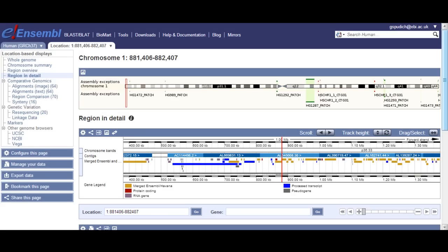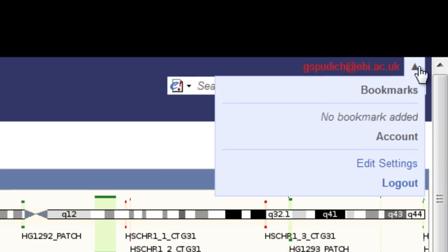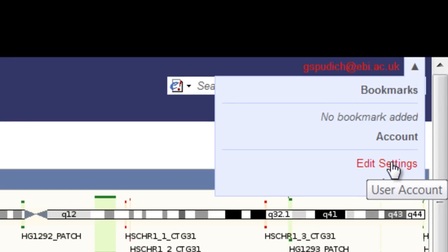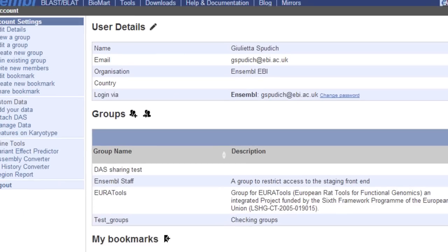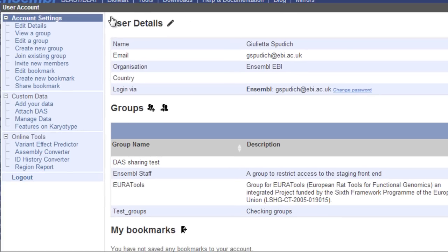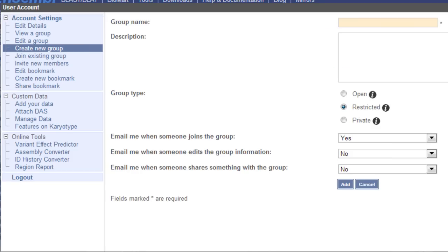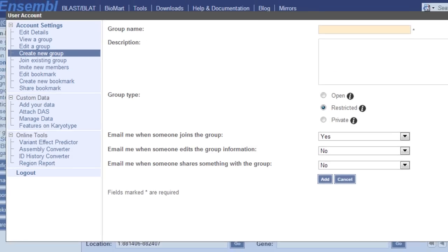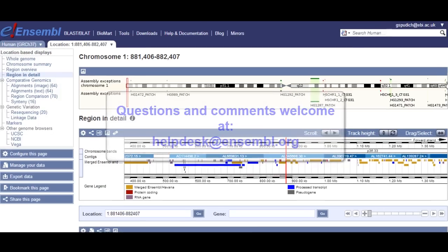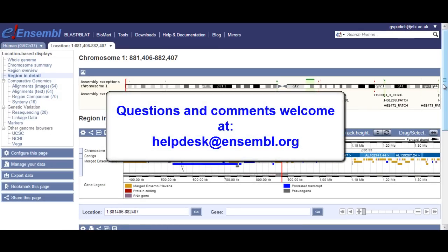You can also share data by creating a group if you have logged in to your account — Edit Settings, Create a New Group. But that's in another video. If you have any questions or comments about this video, contact our Help Desk.